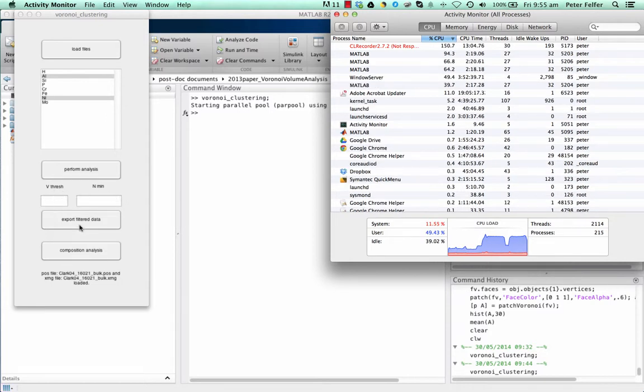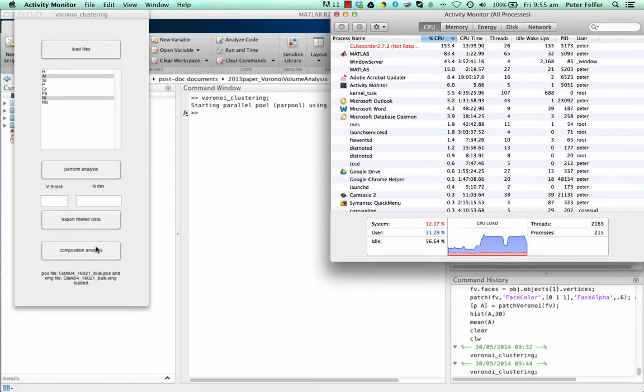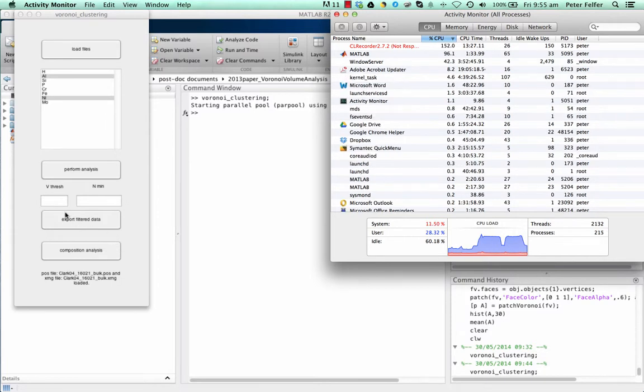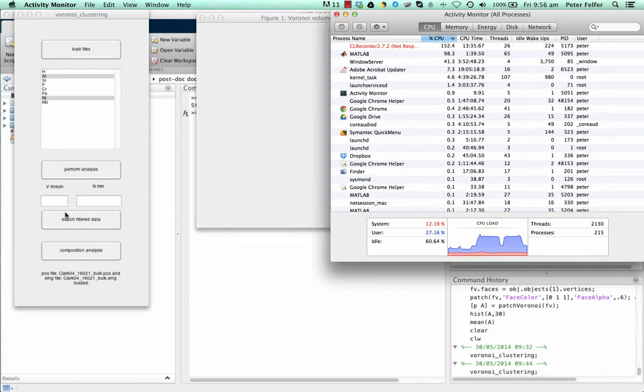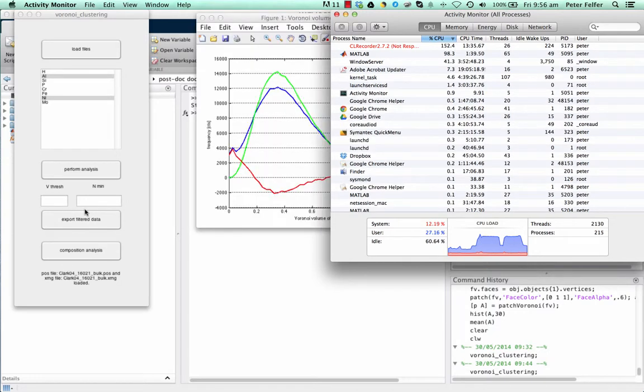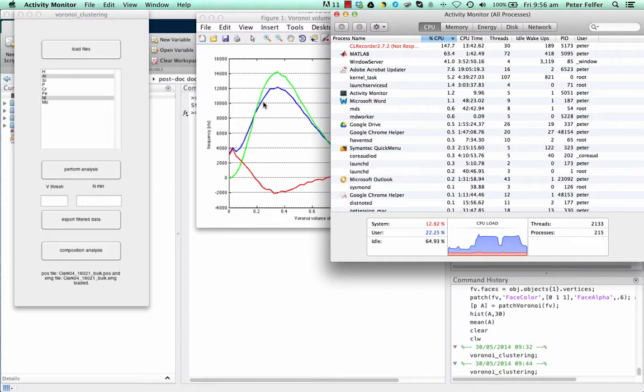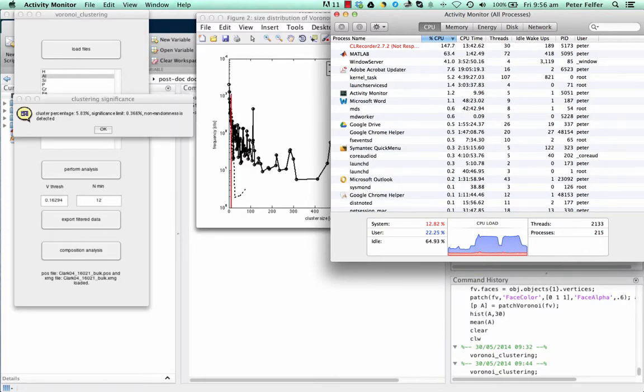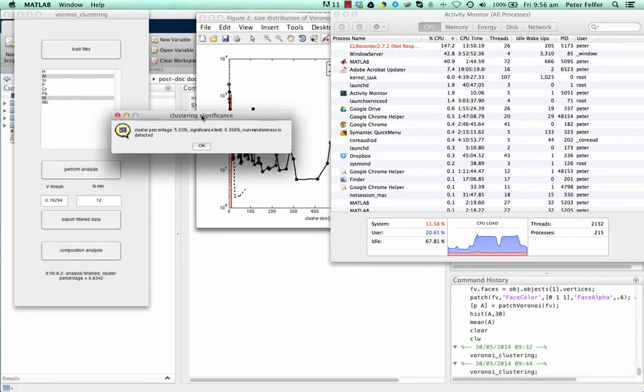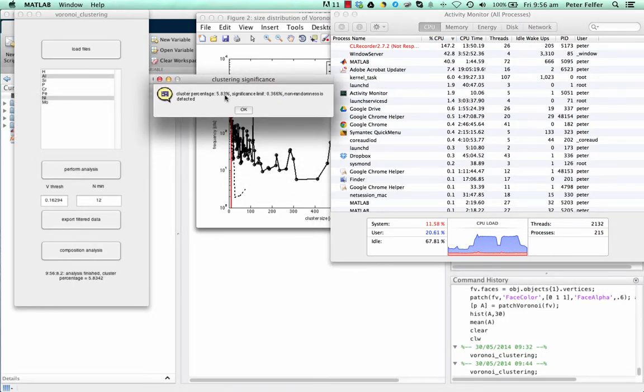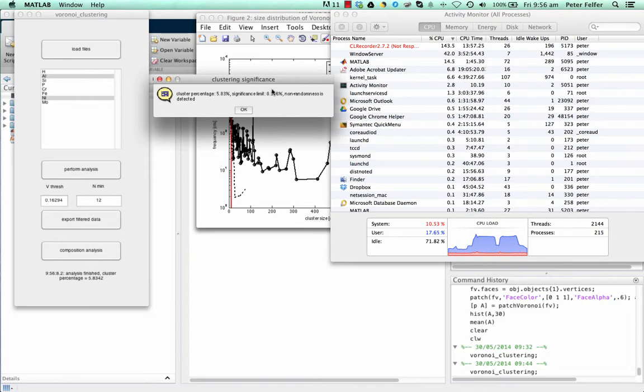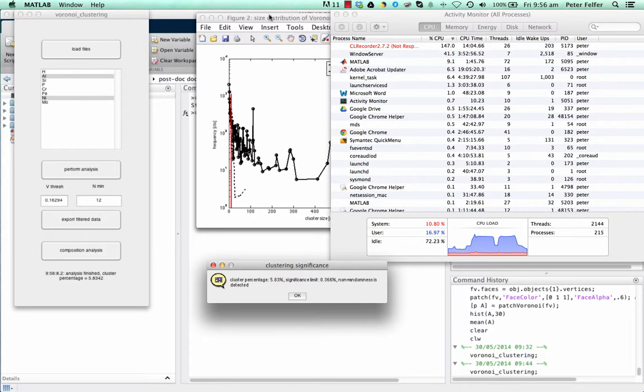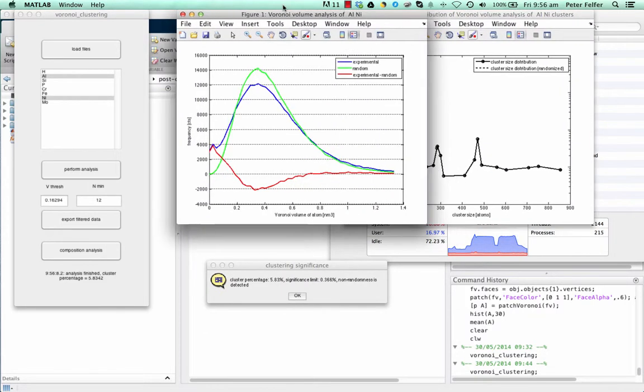There's a very low chance that these atoms are just randomly next to each other as well. These atoms can be removed very easily by coming up with an Nmin value, and both of them automatically process. After that, the only thing that's really left is doing either filtering, exporting of the filtered data, or doing some composition analysis. Now the analysis is done. You can see the processing is done here. We can see that the cluster percentage is 5.83%. And a significance limit of 0.366%. So, the clustering is significant.